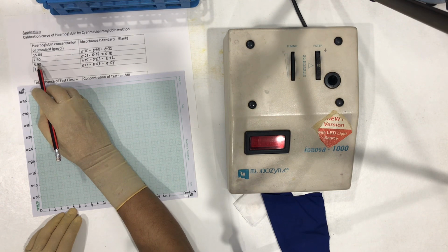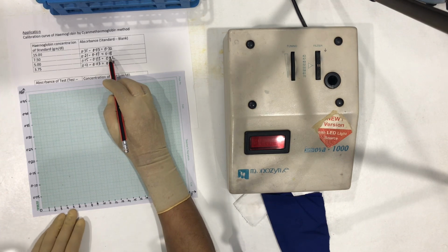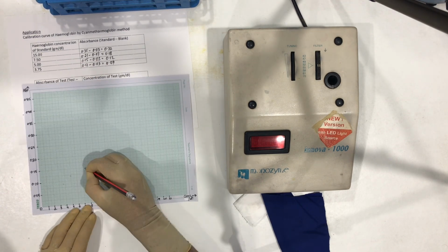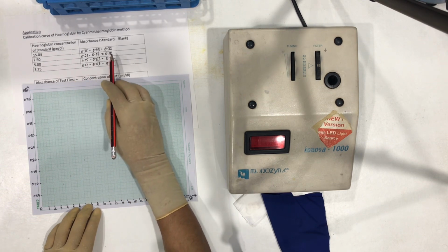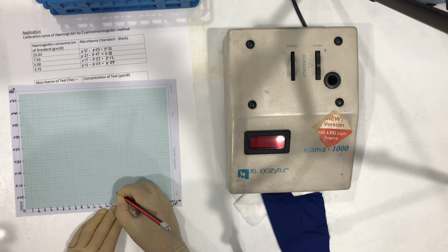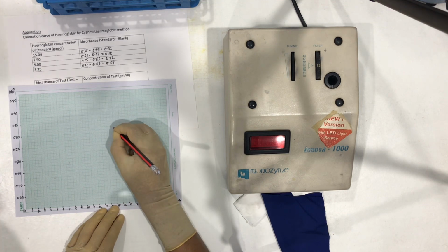Standard 7.5 is giving an absorbance of 0.18. Standard 7.5 out here, 5, 6, 7, 8. Okay, it is out here. Standard 15 is giving an absorbance of 0.32.